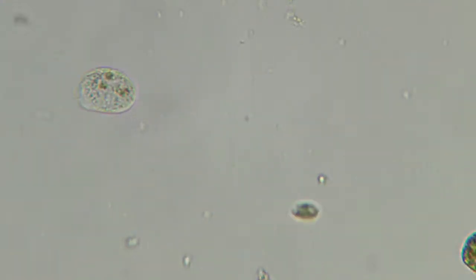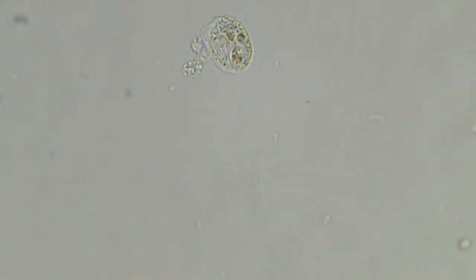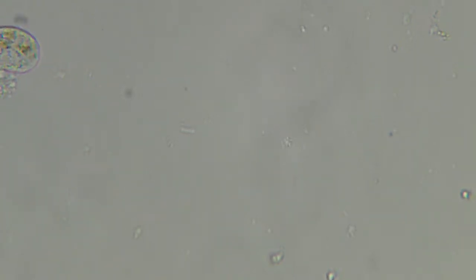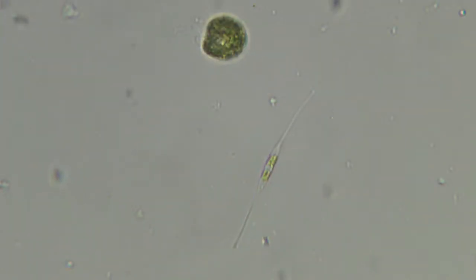Diatoms in the shot. More little guys swimming around. Euglena. Yeah, another one of these guys. Not sure what that one is either. See these once in a while. Fairly nondescript, but you can see it has some color inside from some of the stuff it ate. It's pretty low contrast, so it's hard to get a good, nice shot of it. Again, I'll do a phase contrast show pretty soon, so you can really see these guys pop.